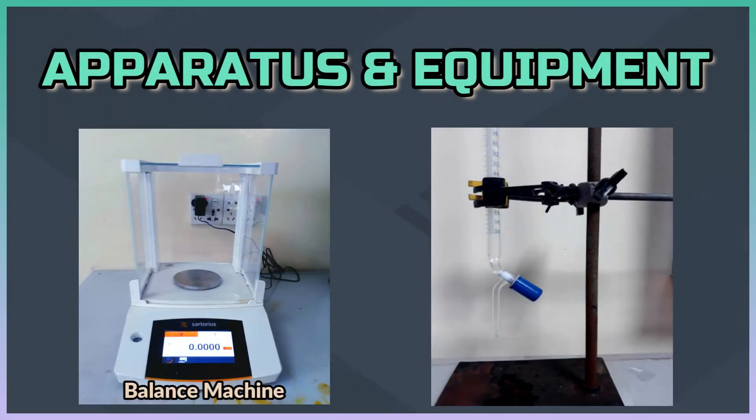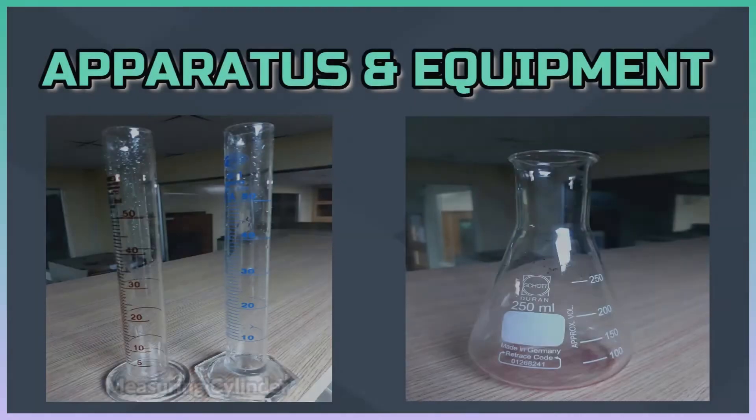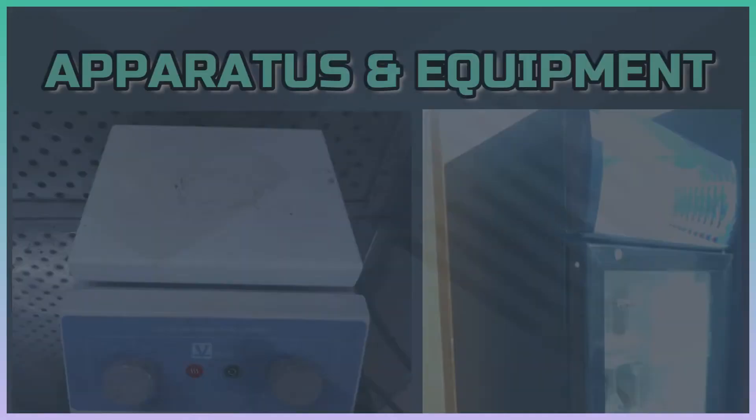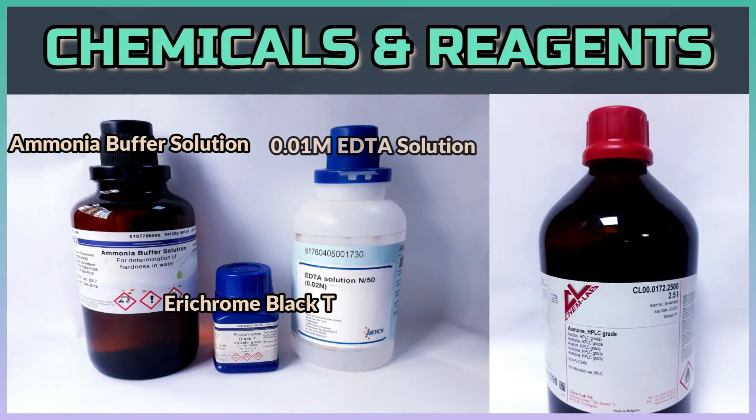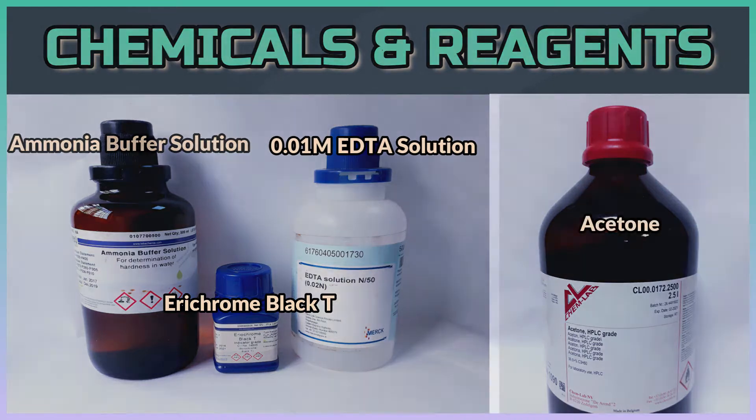To do the test we need a balance machine, burette with stand, measuring cylinder, conical flask, hot plate, refrigerator, ammonia buffer solution, Eriochrome Black T, 0.01 molar EDTA solution, and acetone.